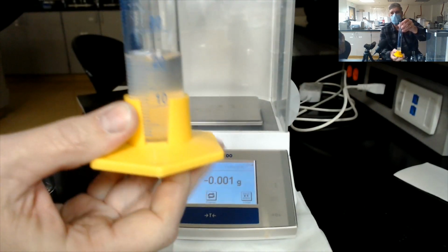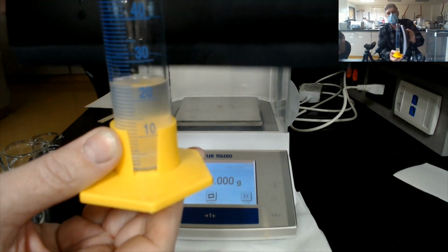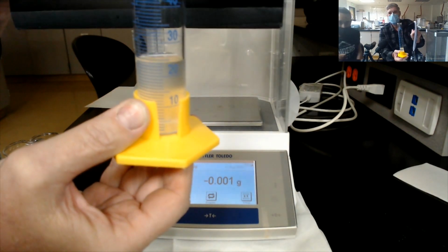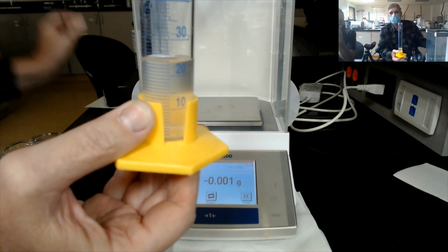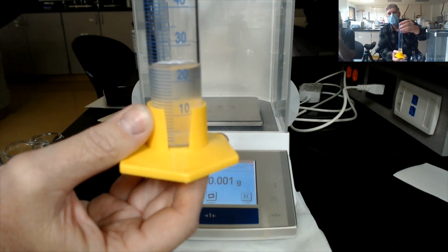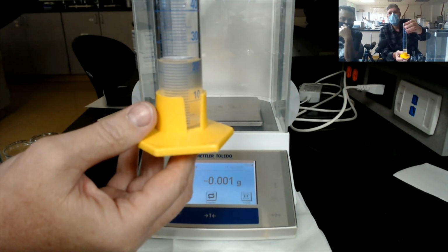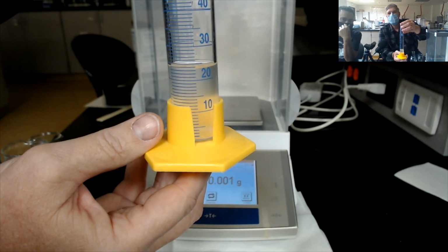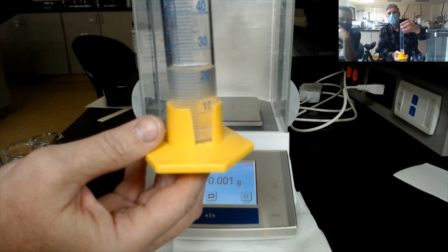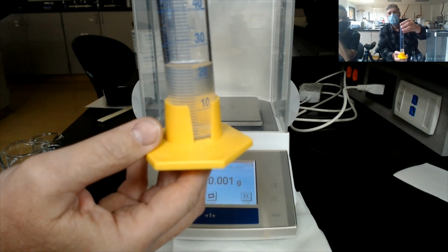So we're going to bring this up and put the black notebook behind it and see if we can get this to focus. You did it for a second. Tell me when I'm in focus. That was good. Right there. Okay, very carefully record this volume to the correct precision. We lost focus. It's okay.